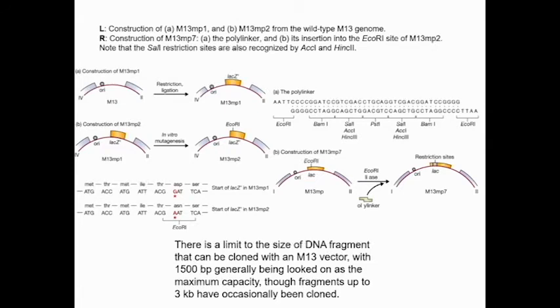Okay, those vectors carry the LacZ gene because that will be easy for us to identify the recombinant cell. But later on, at the end of chapter 1, I believe, we will have more detail. But just to summarize, the LacZ produces this beta-galactosidase, and this enzyme will be able to cut a specific chemical called X-gal.